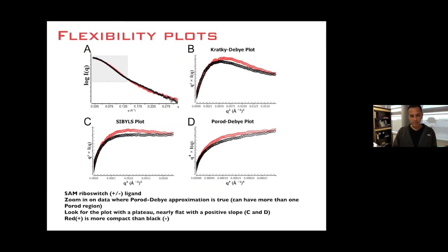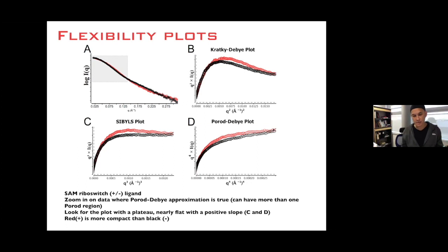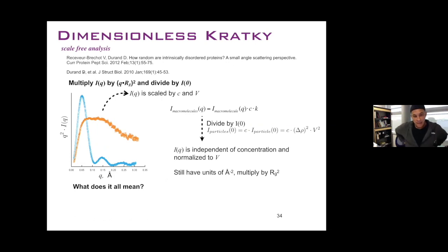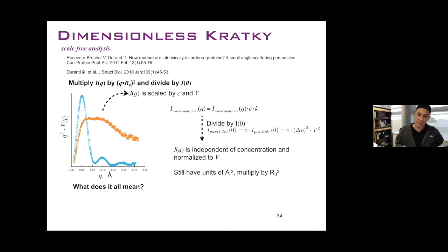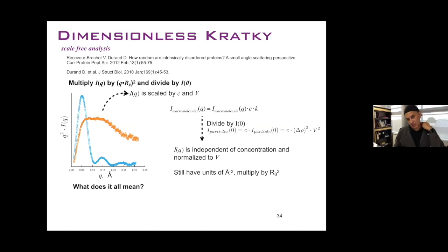In Scatter we have flexibility plots to determine the Porod-Debye exponent. We plot the data four different ways and find roughly where the plateau stops — for the red curve it stops around a certain point, which is important because it sets the q_max. The other thing you can do in Scatter is the dimensionless Kratky plot, an amazing way to look at the data, but a major caveat is that it requires an unbiased I(0) and Rg estimate.